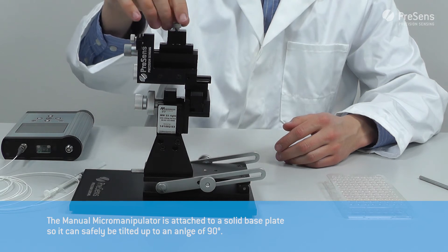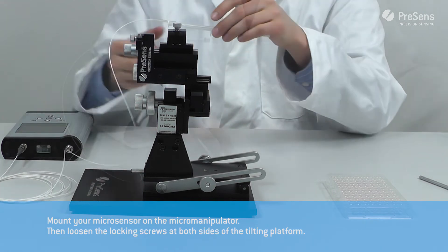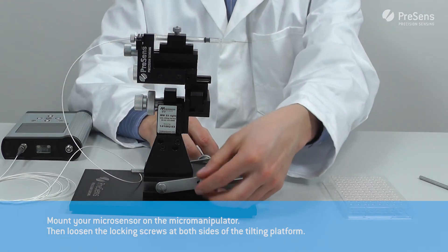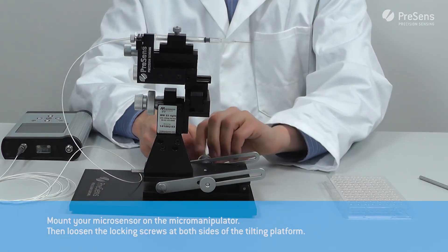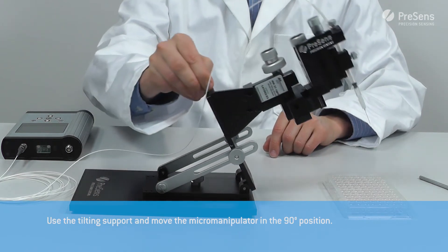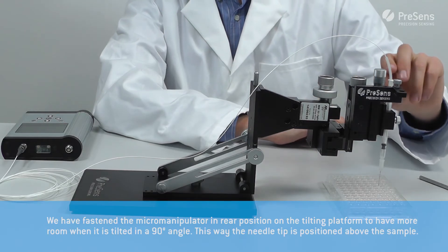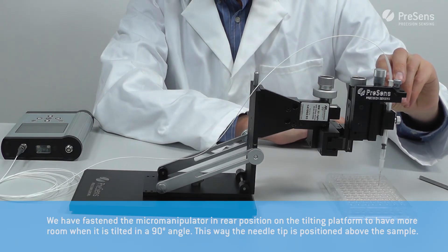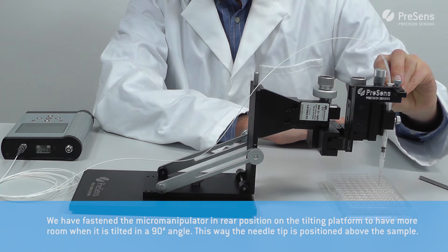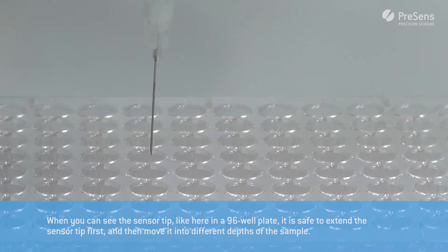Mount your micro sensor on the micromanipulator. Then loosen the locking screws at both sides of the tilting platform and use the tilting support to move the micromanipulator into the 90-degree position. We have fastened the micromanipulator in the rear position on the tilting platform to have more room when tilted, so the needle tip is positioned above the sample.